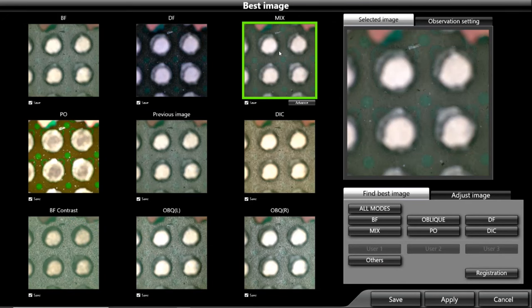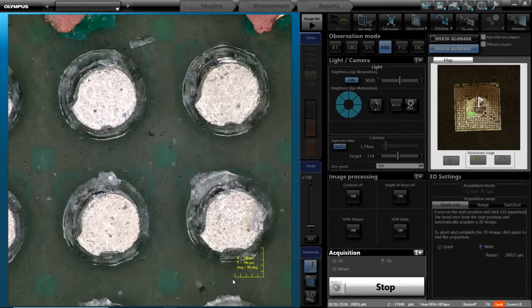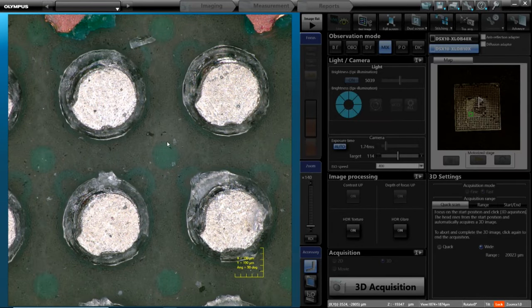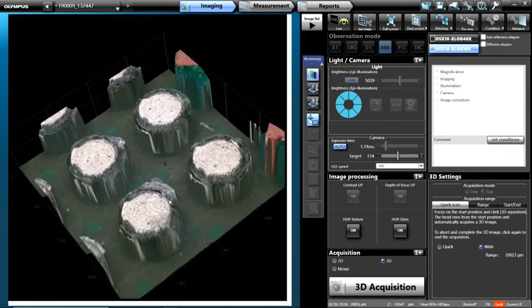If we want the bright field and dark field mixed to see the contrast between the two, all we do is hit apply and it sets up the microscope automatically. And again, if we want to see this all in focus, we can just hit acquire 3D either on screen or on the hand switch, and it goes through and captures all of our in-focus information. You can render those 3D images and rotate around them.